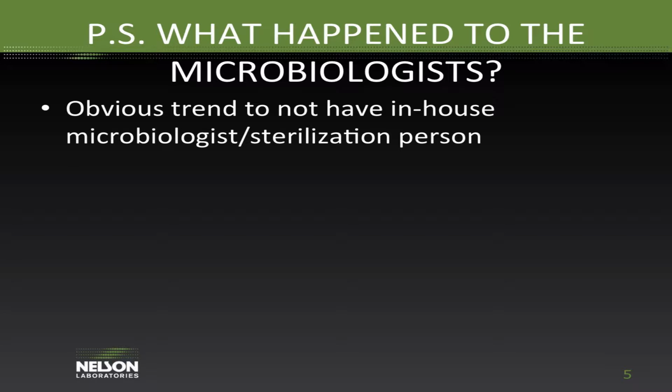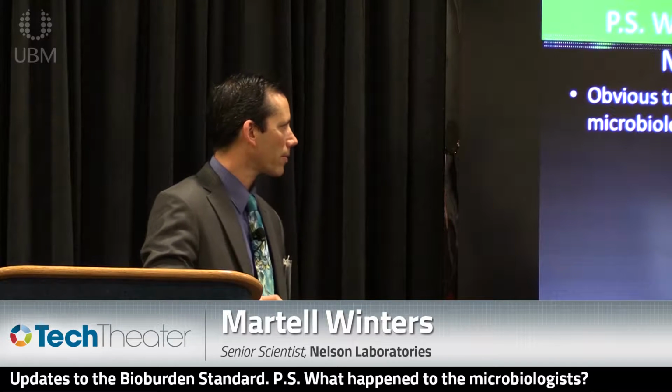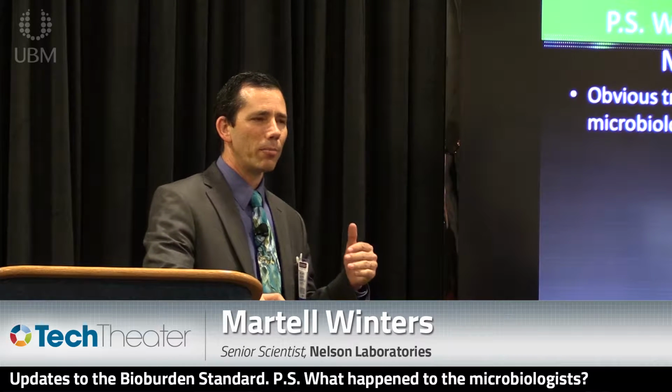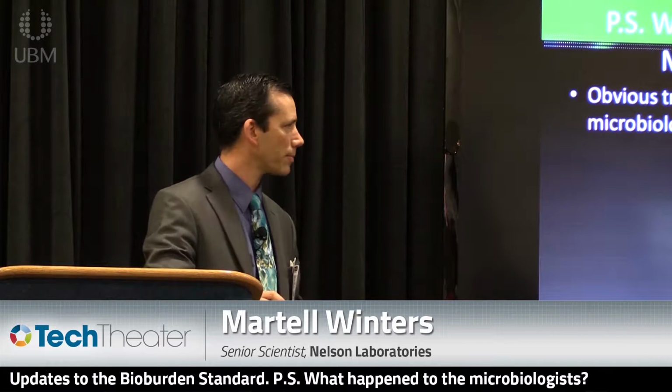Now, you saw I had this PS, what happened to the microbiologists, and my main reason for having that in here is a lot of the guidance they're asking us to add into the Bioburden standard is a result of the fact that we're seeing a reduced quantity of knowledgeable microbiologists that work on site at manufacturers. And it's an obvious trend in the industry that there are not sterilization or manufacturing microbiologists that work on site at the facilities.